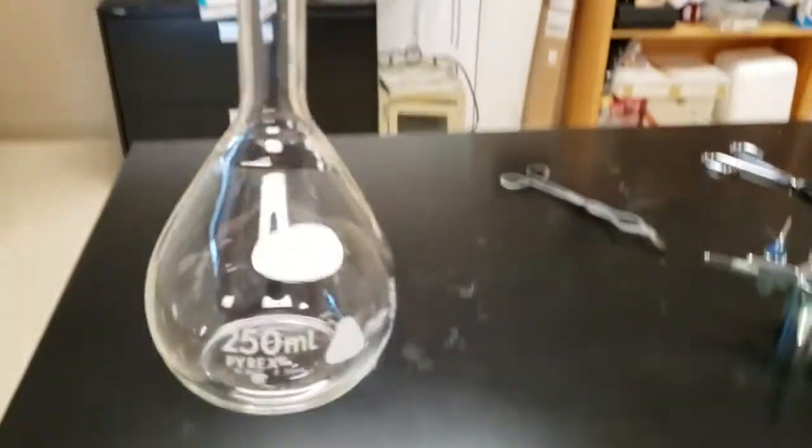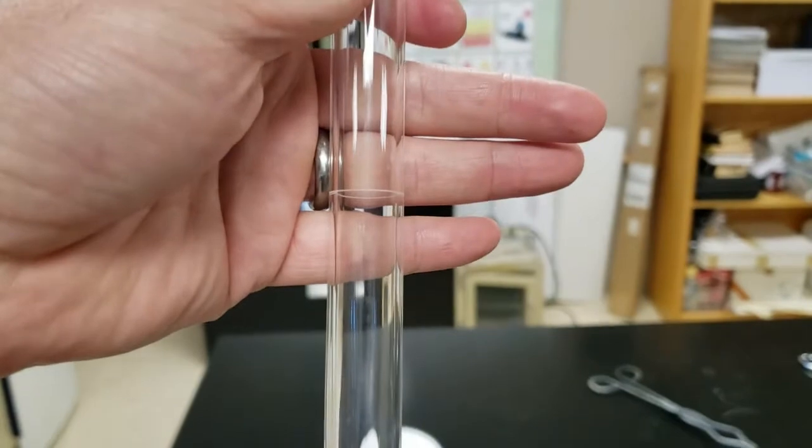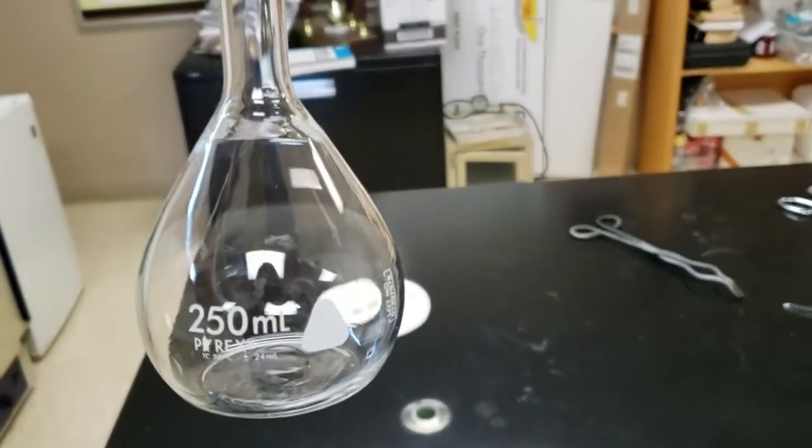These are volumetric flasks. They're volumetric because they measure one volume. There's a single line on there, and that's what it measures. It tells you the uncertainty on the bottle. They're used for making solutions.